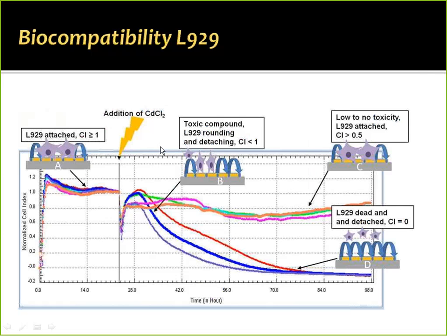What's novel about what we were doing in the laboratory is just simply the application. Cytotoxicity has been well established using the xCELLigence, but using it in the medical device industry has been somewhat of a novel thing for us, and it's really been a time saver in a lot of ways. So this is what you typically see in terms of a cell index.